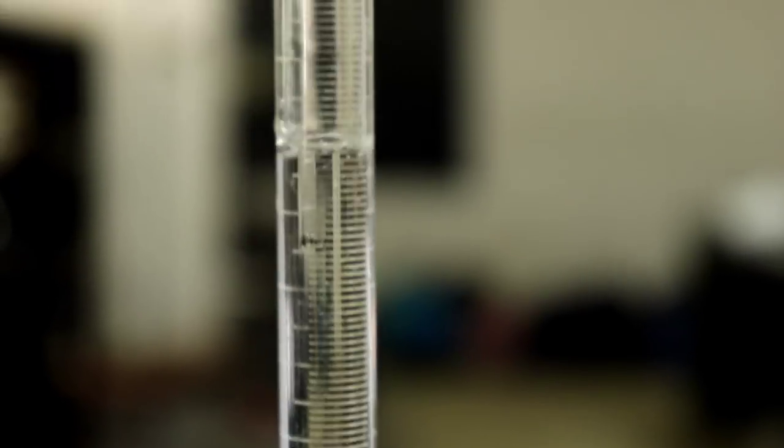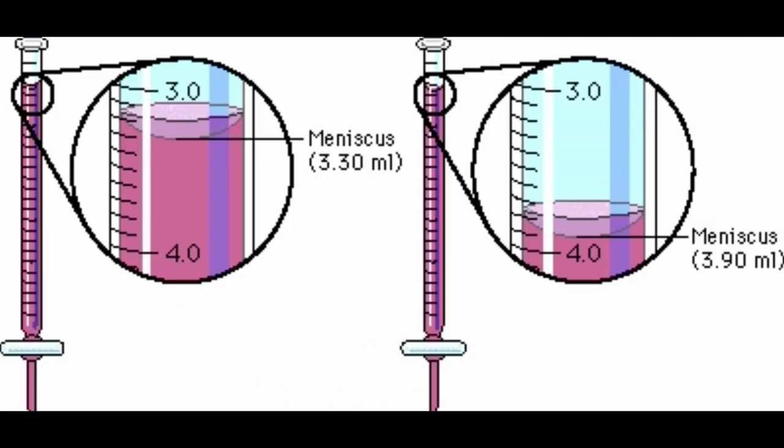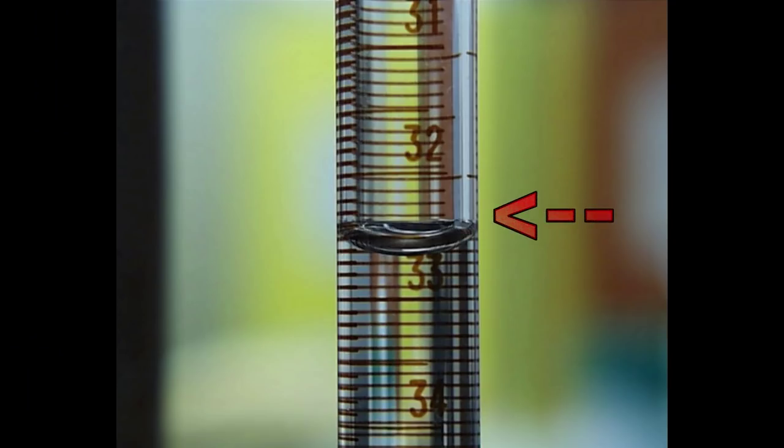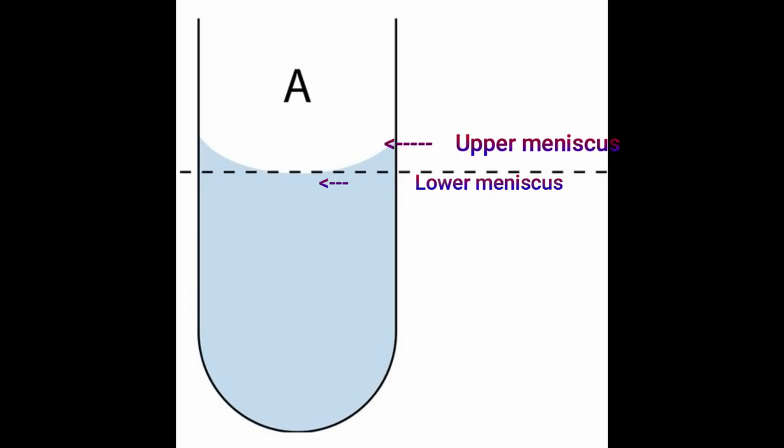Once the air gap is removed, fill the solution in the burette above the zero mark. For colorless solution we need to see the lower meniscus and for colored solution we need to see the upper meniscus.